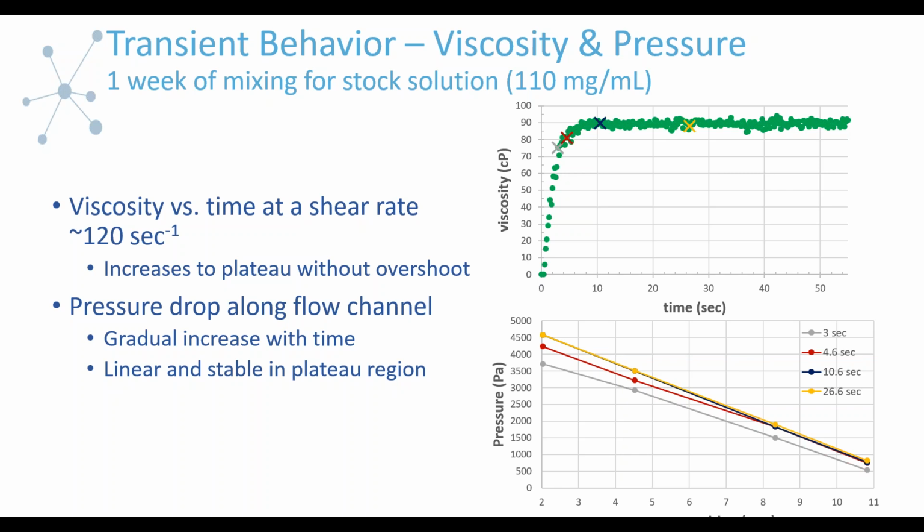So you have to initiate the flow, and then it takes a short period of time for the profile to fully develop and reach a steady state. If we look at the pressure drop along the flow channel, as we did before, again, I've marked the time points where we pull up the profiles. We see that there's a gradual increase with time, and the profiles remain linear and stable in the plateau region. So again, this indicates that things are flowing uniformly, with fully developed steady state profiles, as expected.